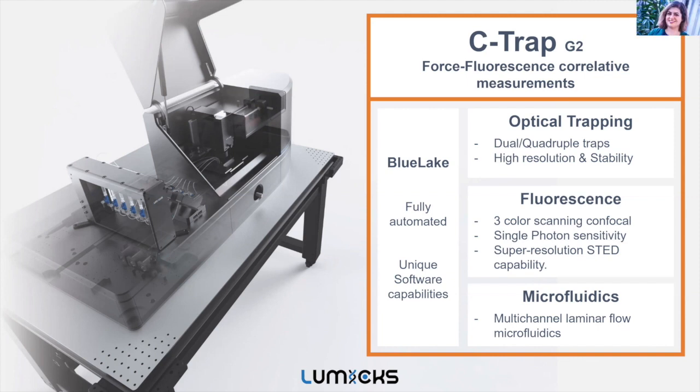Well, it depends even for magnetic tweezers. In the setups that you would apply, you can apply forces to multiple beads at the same time. Obviously that would be higher throughput. But even for magnetic tweezers, there are systems where you look at a single bead at a time, or you look at multiple beads at the same time. But in this case, because you only have 2 traps or maximum 4 traps, that is the limit.